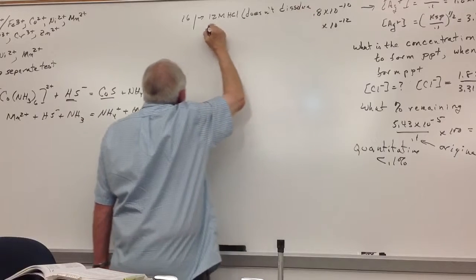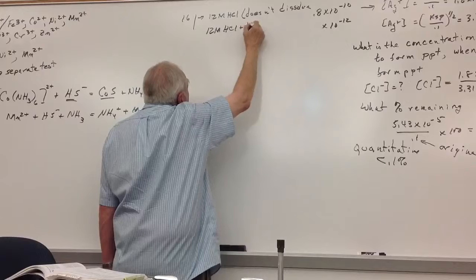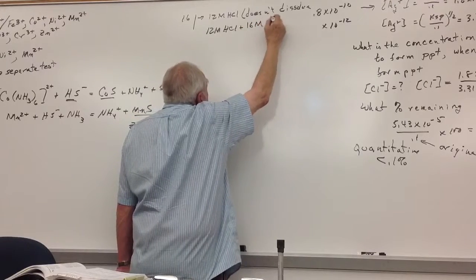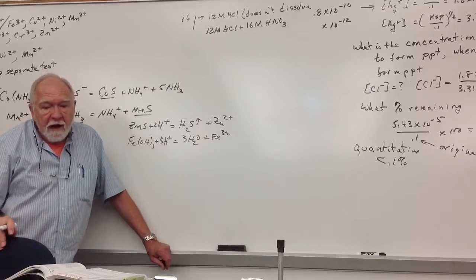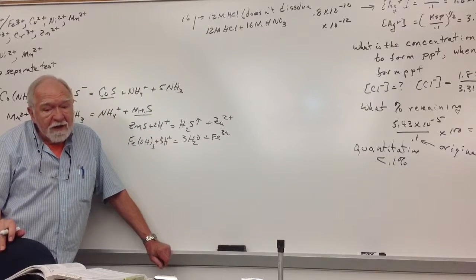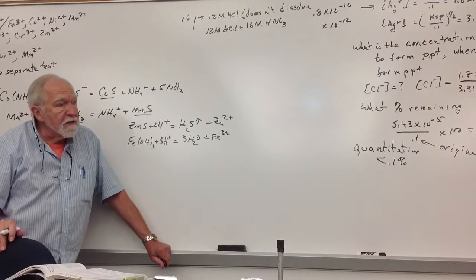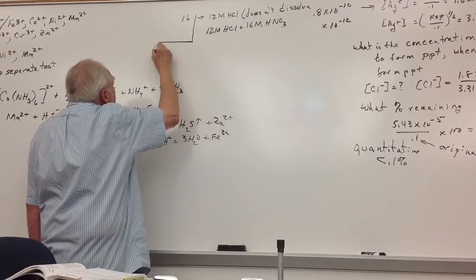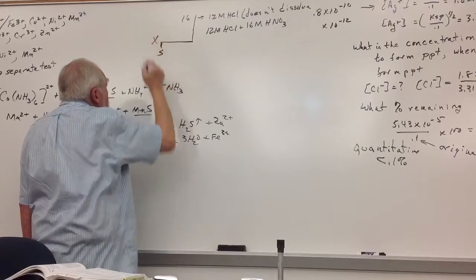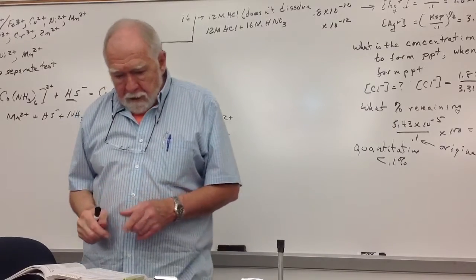We're going to use what? Your aquaregia mixture again. And you replenish it till everything dissolves. The only thing that won't dissolve, you may get some yellow sulfur, which you don't say. That's what that means. Okay.